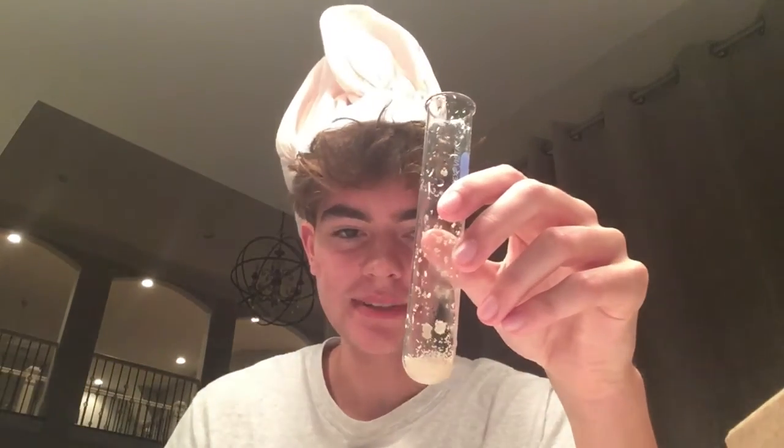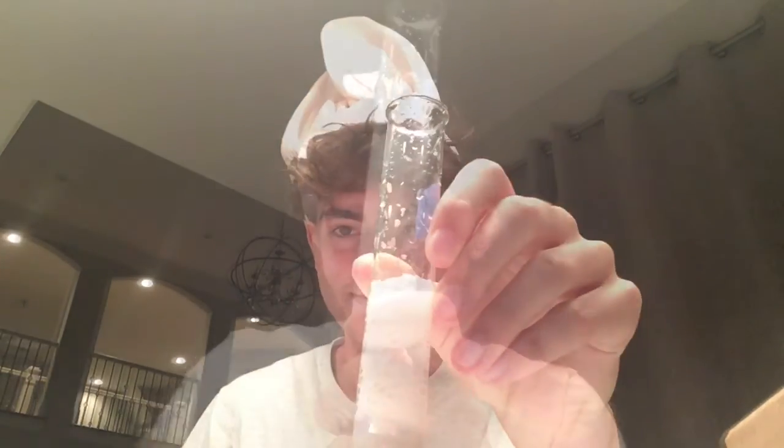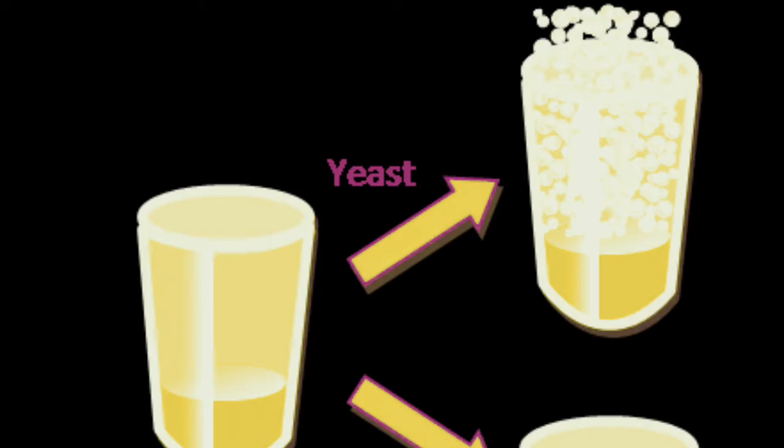Similarly, let's do the same thing to the yeast. The catalase in the yeast breaks down hydrogen peroxide and produces the bubbles. It also produces some extra heat. The use of yeast and hydrogen peroxide is to provide an easy observation of the chemical reaction. Similar to the raw potato, the catalase within the yeast breaks down hydrogen peroxide, and this reaction causes oxygen bubbles and also heat.